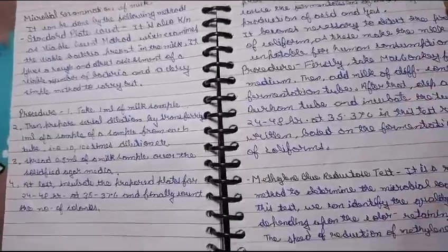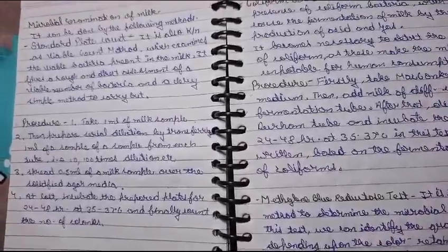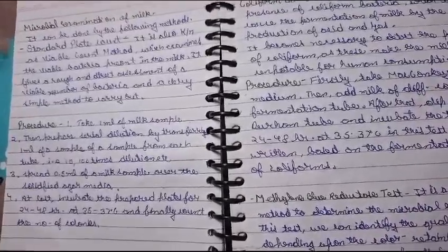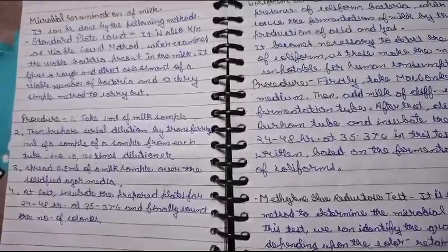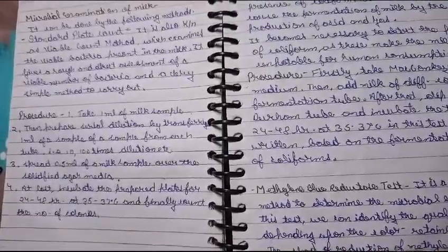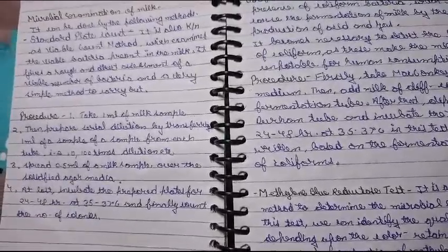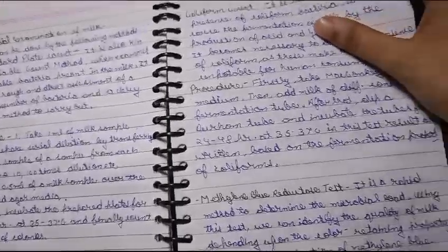Next test: methylene blue reduction test. It is a rapid method to determine the microbial load. Using this test, we can identify the quality of milk depending upon the color retaining property, the speed of reduction of methylene blue.